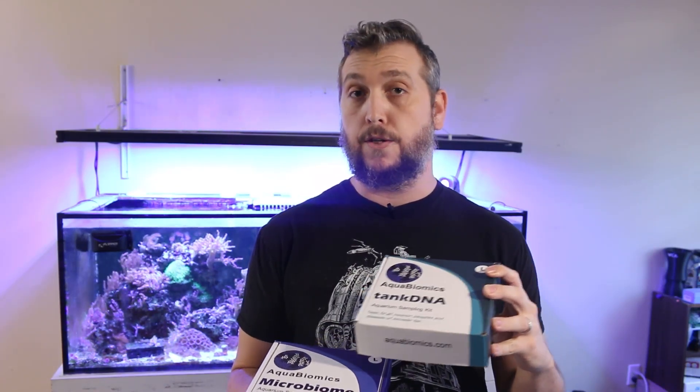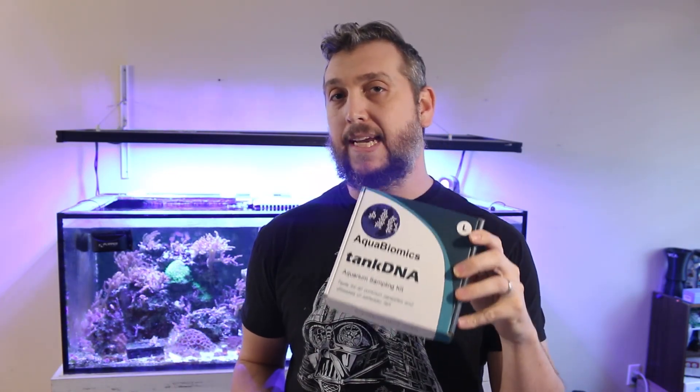There's a microbiome test that will test your microbial community — testing your pathogens, your beneficial bacteria, your bad guys, your nitrifiers, and so on. Then you have your tank DNA test, which will test for common parasites and diseases of saltwater fish. It can tell you a lot about what's going on in your water column.